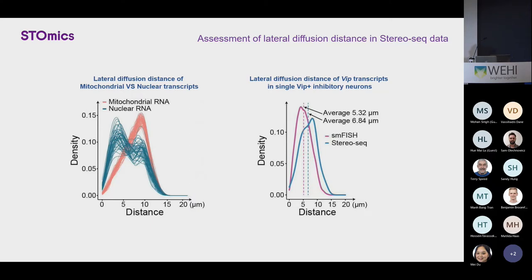I'll be going over some of the work we've been doing recently using PFA pre-treated samples, which we've been able to show give diffusion distances comparable to SM fish or even better.